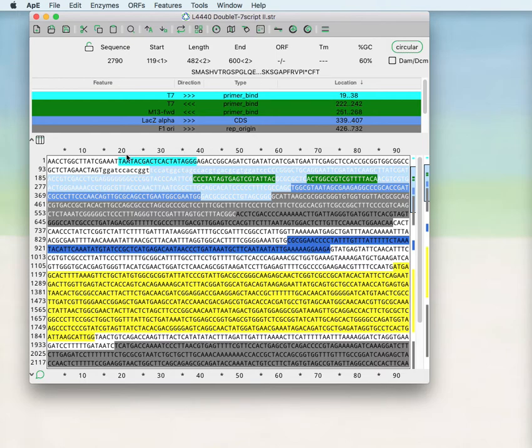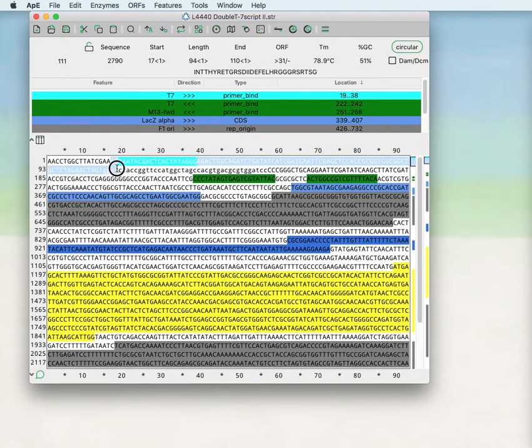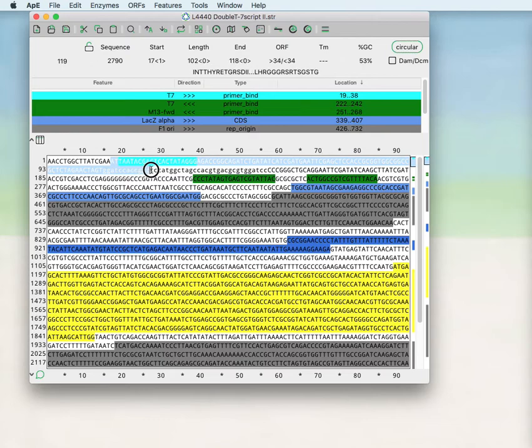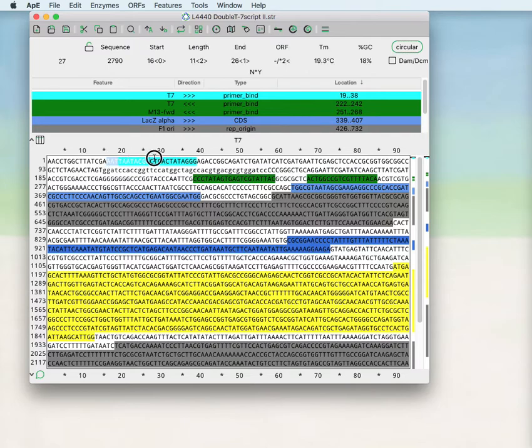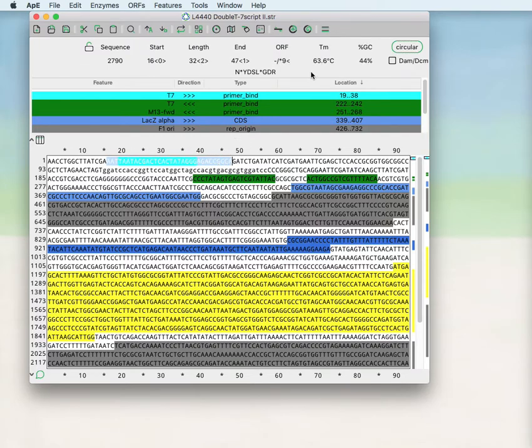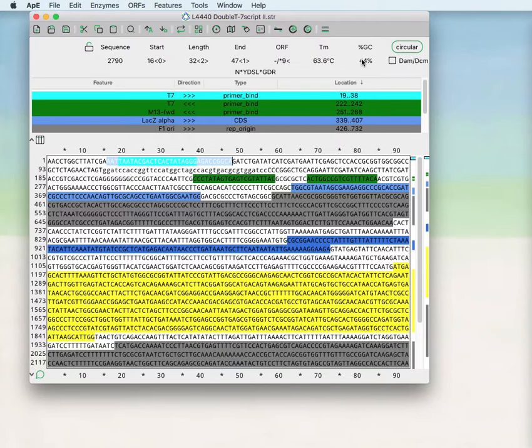Then there is an indication of whether there is an open reading frame in the forward and the reverse direction and how many amino acids long that reading frame is if there is one. For shorter selections, the melting temperature is calculated for the selected DNA as well as the percent GC basis.